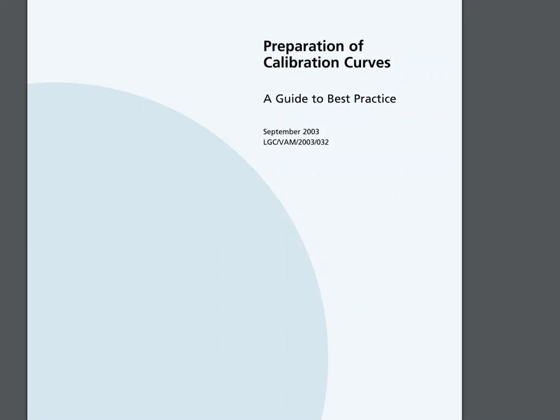Okay, so what I want to do in this video is just to highlight and review this document that I've made available to you called Preparation of Calibration Curves.